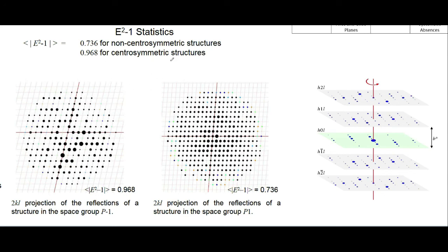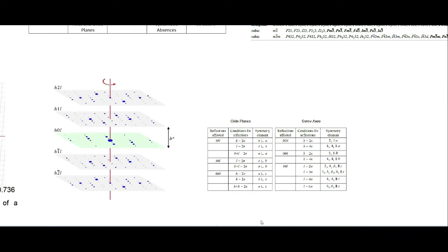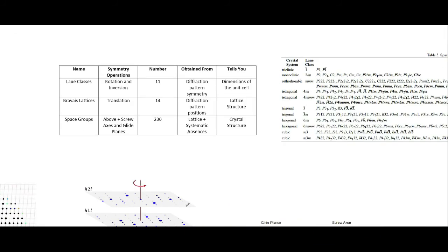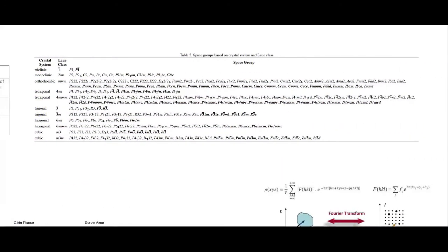And so this is one of those places where I debated just how far to go down the rabbit hole of symmetry. There are full textbooks on these ideas of symmetry and point groups and things like that. So I don't want to get too bogged down in it. I think I'm just going to go to this table that I made here. And so what we're looking for are the space groups, which I have the list of right here.